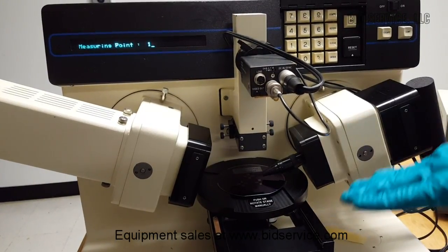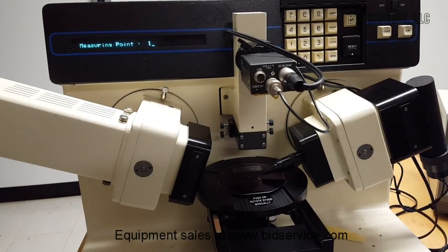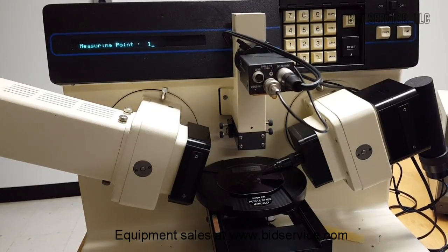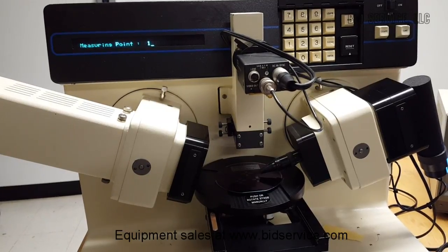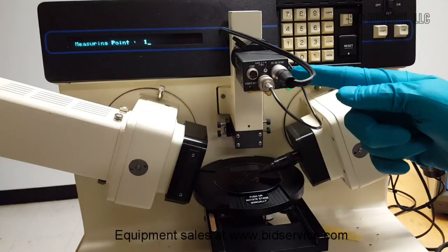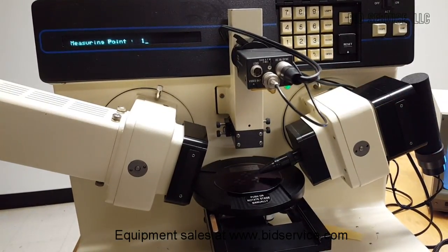Currently the analyzer and the polarizer are set at an incident angle of 70 degrees, and there's a photomultiplier tube detector here. And the CCD camera here is connected to the monitor, the output of the camera.